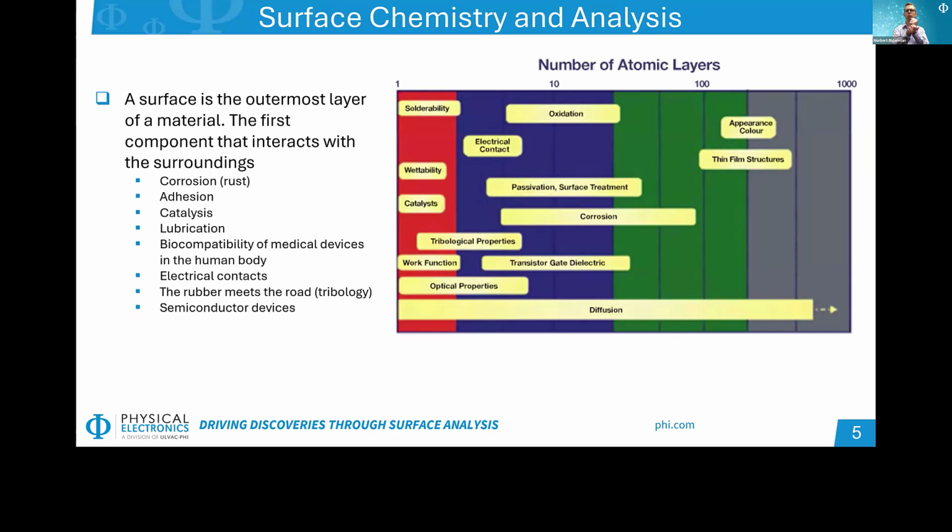I am starting the talk with a brief discussion on what surface analysis is and why surface chemistry is important, along with a diagram showing the extent of surface effects in terms of the number of atomic layers below the sample surface.